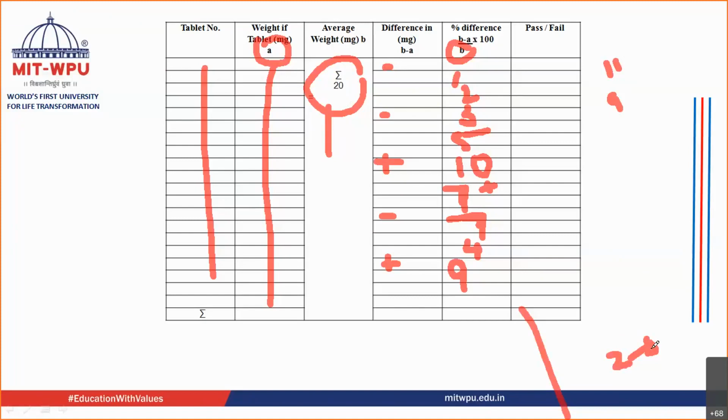Jivika said yes. So tell me which tablets have failed. Jivika, open your mic and tell me which tablets have failed. So it depends on what the average weight is. From this data, you won't be able to tell unless I give you the average weight of the tablet.